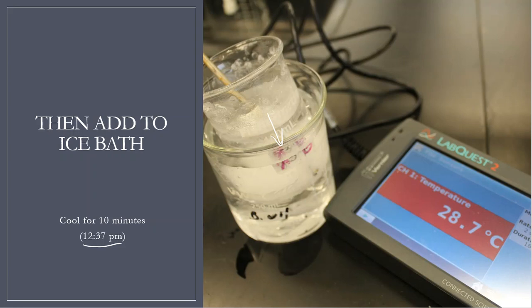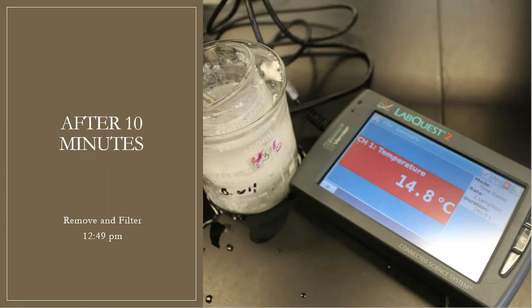The directions do give me a duration that's preferred, so that is one of the reasons that I write down the times whenever possible. All right, so about 10 minutes later, 12:49 is when I begin to take this out. The temperature readout was 14.8, so it did go colder, but it didn't go to what I would say freezing. Whenever we use an ice bath, very often we would see like 5 degrees or 8 degrees Celsius. This had a little bit further to go, and part of that reason is just due to the ice bath temperature itself. My ice was melted at this point, but this is cold enough for what we need. At least that's what I thought.